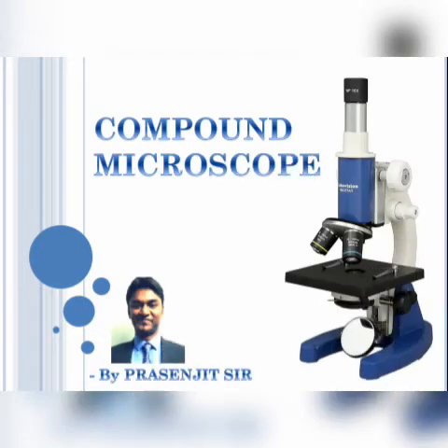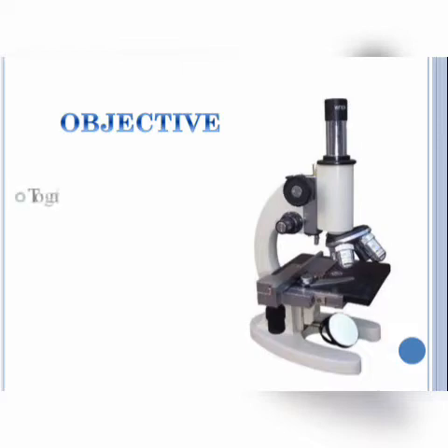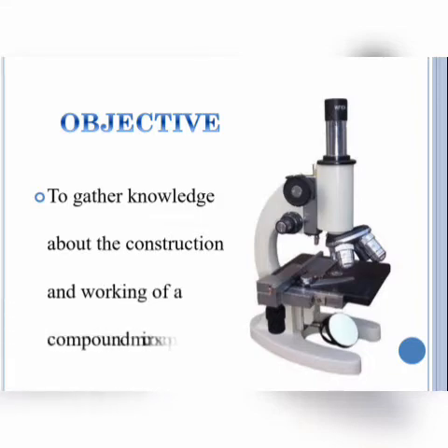Hello everyone. In this video, let us get a glimpse of compound microscope. Here, we are going to gather knowledge about the construction and working of a compound microscope.